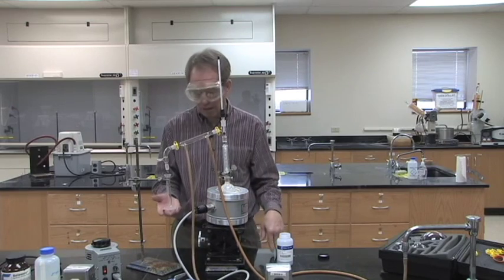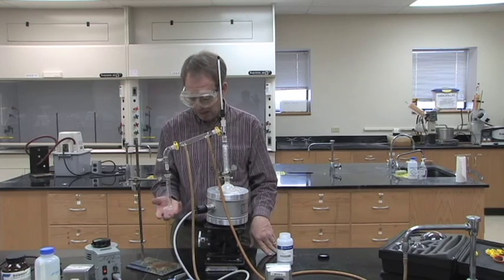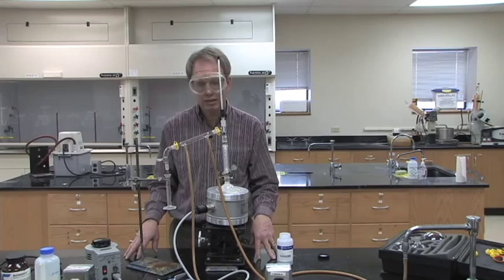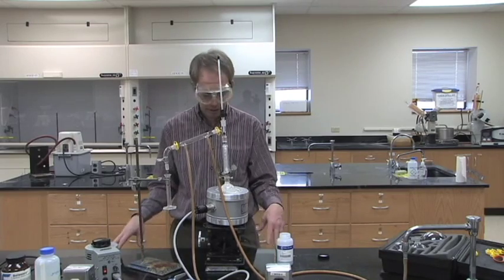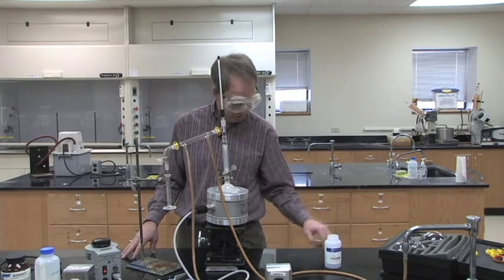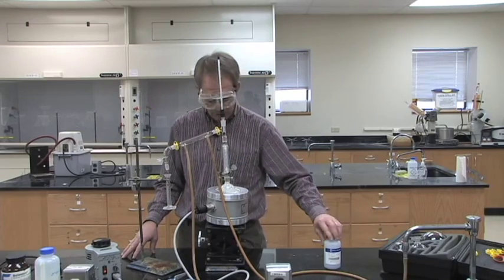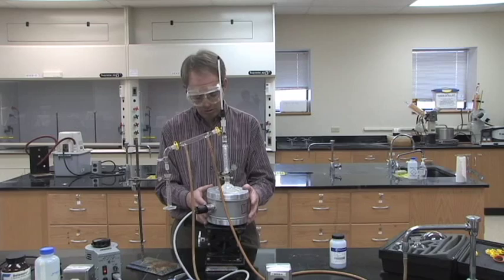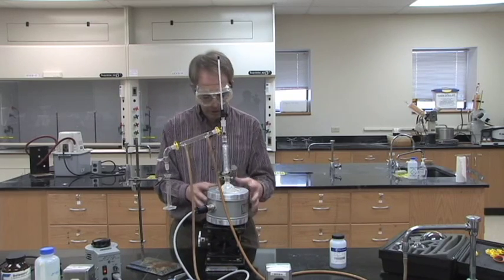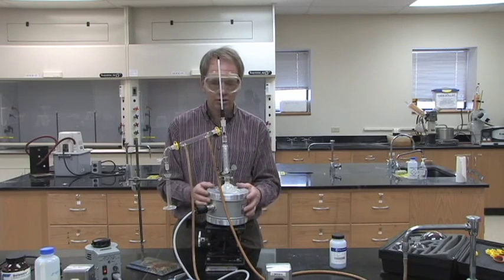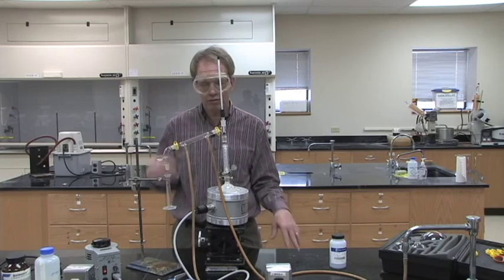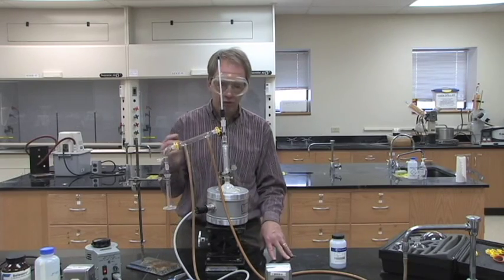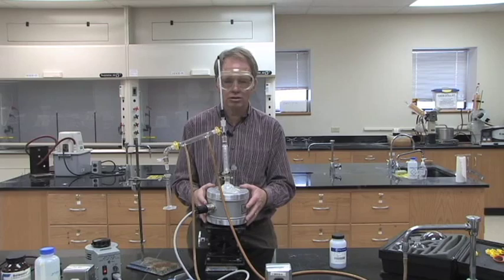You can make a graph of the temperature of your distillation versus how many milliliters you have, and then you can compare that to what a simple distillation would look like. Fractional distillation is basically what they do at an oil refinery where they start with crude oil in the bottom and distill off at the different fractioning points the different grades of petroleum distillates.